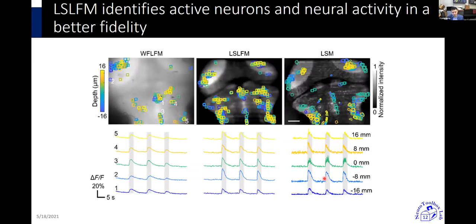We did this in zebrafish, and the same kind of qualitative notes can be seen again. So here's the wide field illumination. Basically, everything gets lit up in a large haze. And then in the light sheet approach that we did, we can see much more structure, including the optic tectum, the thick forest of fibers, some cells, very much like how the higher resolution light sheet microscopy can do, except this required scanning, whereas here we can obtain a volumetric image within one capture of a frame.